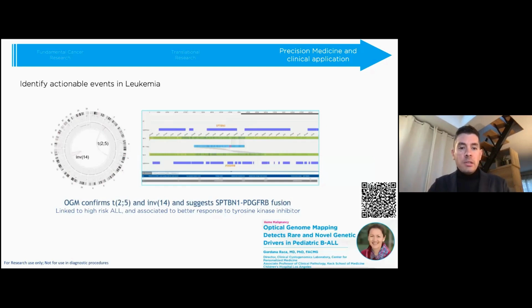And 2 cases really stand out in terms of discovery that I would like to develop a little bit. This sample is from a patient that had a poor response to treatment and developed a residual disease requiring more aggressive treatments down the road. A translocation 2;5 was identified by karyotyping, but at the time of diagnosis, they did not really understand the significance of such a rearrangement.